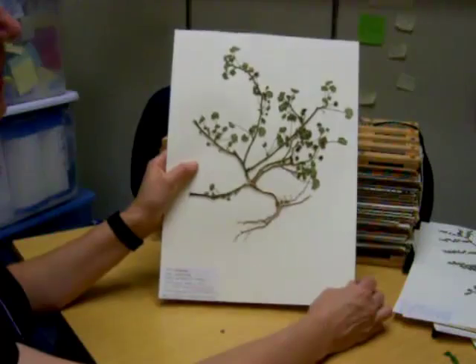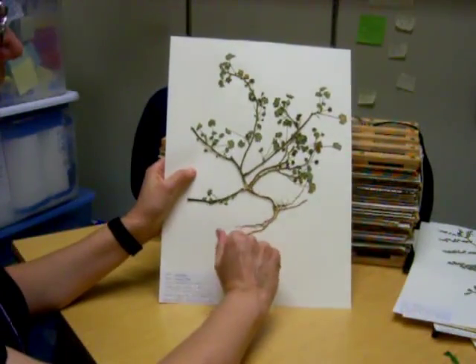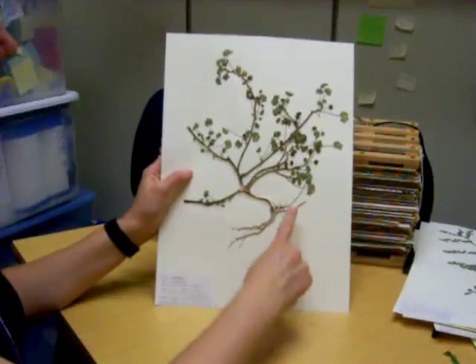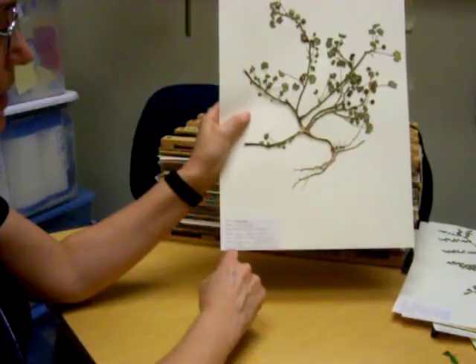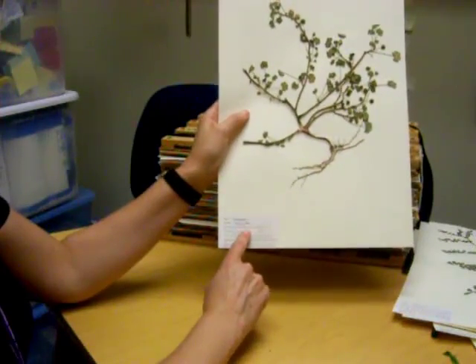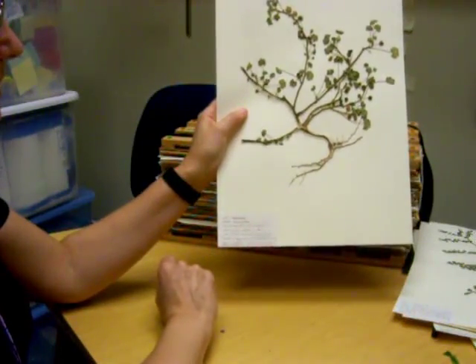So that's kind of what we're aiming for. This one has nice clean roots on it and it stays on the whole sheet. Down here in the flush lower left corner is the label, and that's exactly what we want to see.